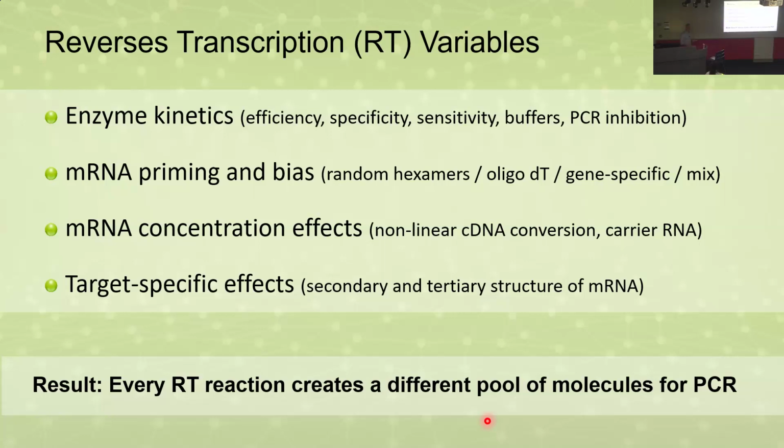Which is why when you do an RT-PCR reaction especially, you do everything at once and then you run the experiment, right? And when you come back next week or next month or next year or on the other side of the earth, you have to do it all again. You can't add to that result set because things don't add up. With nanoString, that's not the case, but it kind of tells you something's pretty fishy here.